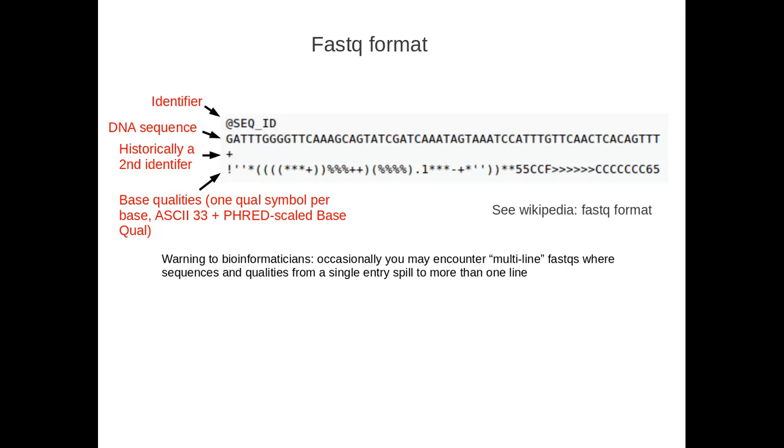For all of the standard sequencers, we can assume that the reads will be positioned in the right positions in the forward and reverse files. Anyways, that's just a note, because that was something I worried about when I first started handling this data. So I'll let you go back and review what these different lines mean.